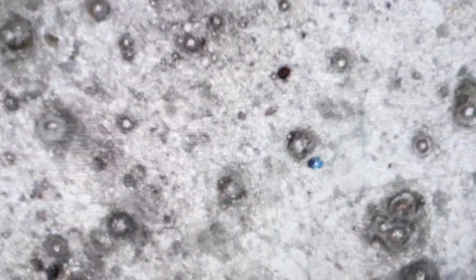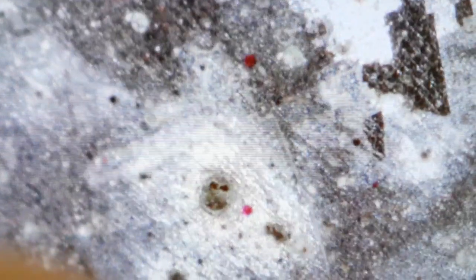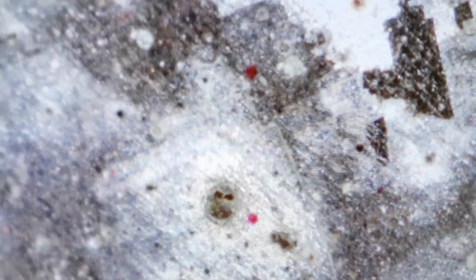Then that's with everything on, and turning the polarization on. What's going on with these red spots? That's with the specular in there, polarization off, and then we put polarization on, still got the red spots though.